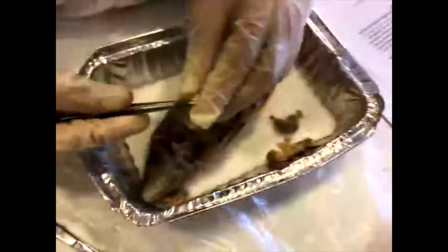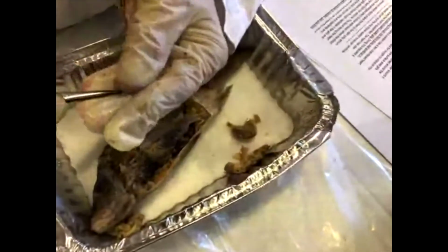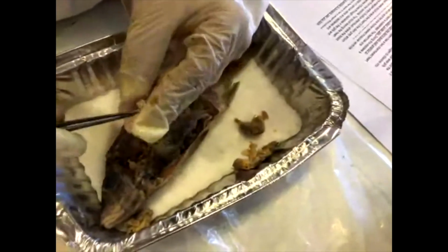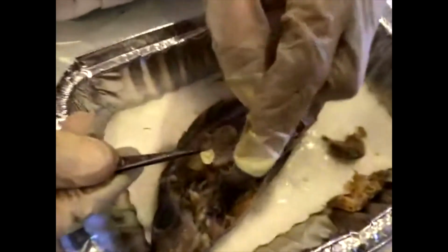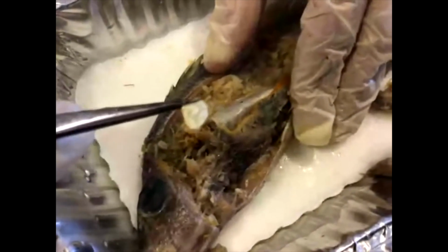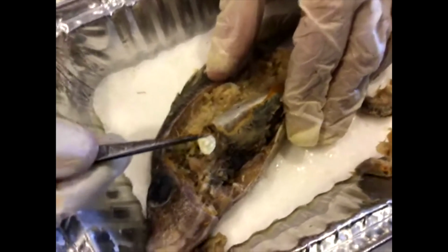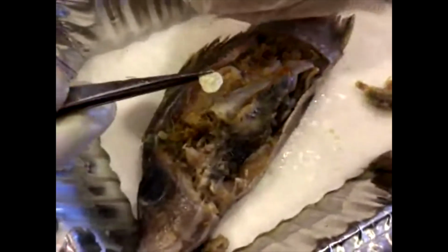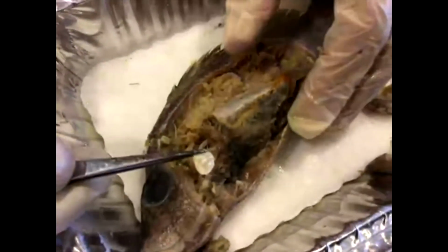Nice, good work. So this is in fact an ear bone, and I don't think you folks are going to be able to see it because they're really, really tiny, but there's actually little bumps all the way around the ear bone. The ear bone continues to grow throughout the fish's life, so each bump is another year in its life. Scientists can look at this ear bone, count the bumps on it, and know how old the fish is. That's really important to biologists because if you understand what the average age of a population is, you can kind of predict how that population will do in the future.